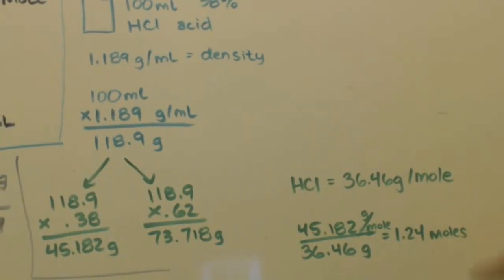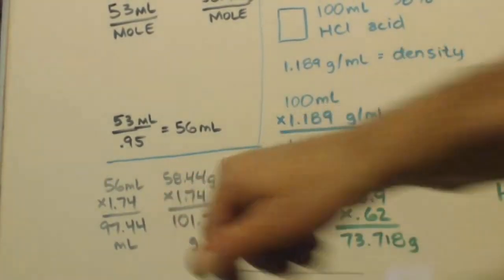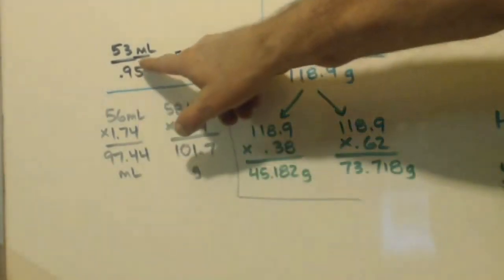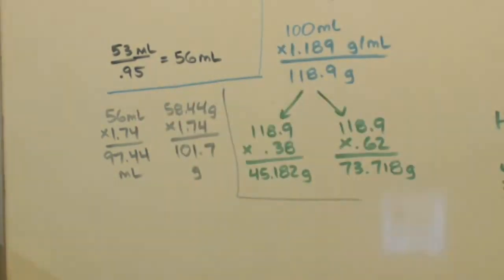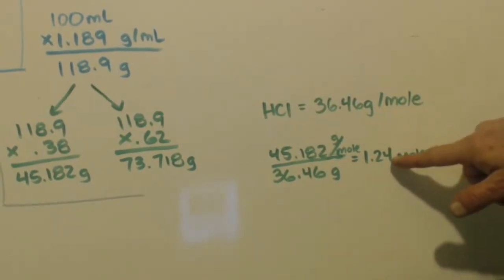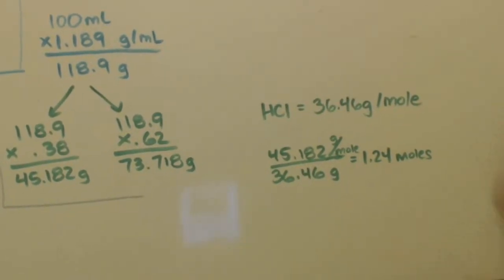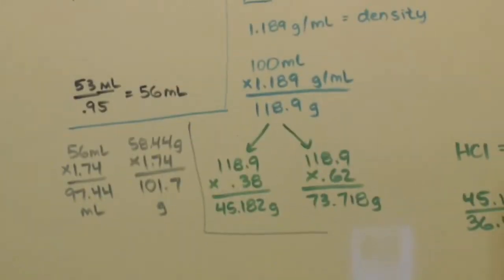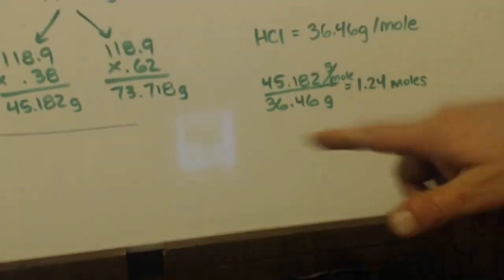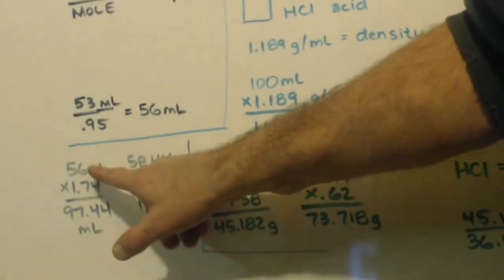Alright? So, look over here. That's 1 1/4 moles almost. Now look at this. We decided on 56 milliliters for the sulfuric acid. So we're going to take it times 1.74. Why? Because we need at least 1.24, right? I'm going to add another half a mole in there for loss. You know, you've got to fill up the apparatus, and stuff isn't going to be absorbed. All the loss, I'm going to hope that it's a half a mole or less. Because I'm putting on a half a mole. 1.24 plus 0.5 would be 1.74. So I multiply that by 1.74.